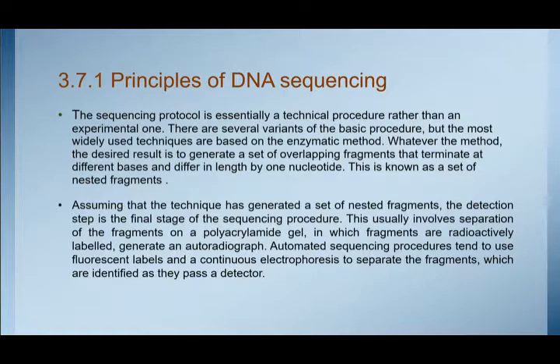Whatever the method, the desired result is to generate a set of overlapping fragments that terminate at different bases and differ in length by one nucleotide. This is known as a set of nested fragments.